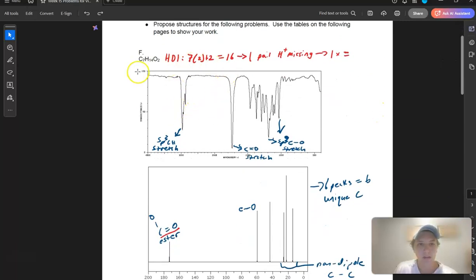When we go down and look at the IR spectroscopy, see the common peak for sp3 CH stretch. I don't see any broad OH tongue or an aldehydic sp2 stretch.